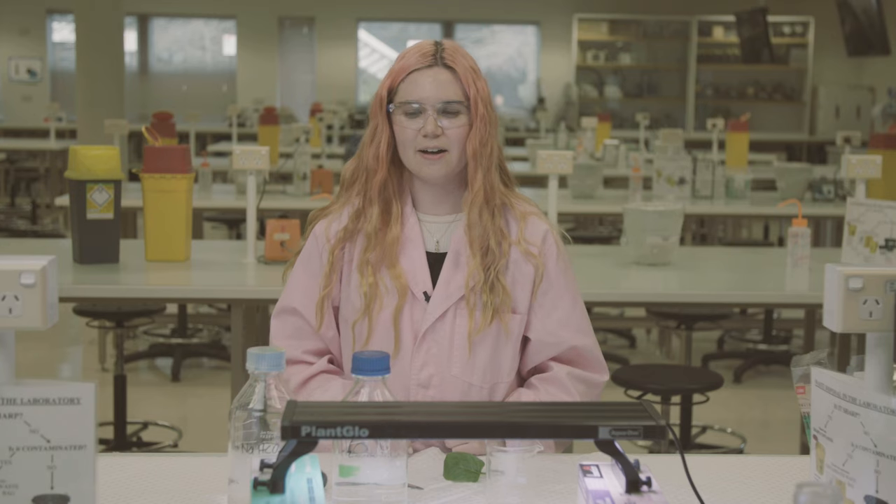Hi, I'm Bec. I'm a PhD student here in the Training Centre for Future Crops. And today I'm going to show you how to do leaf disc flotation, which is an indirect measure of the rate of photosynthesis.